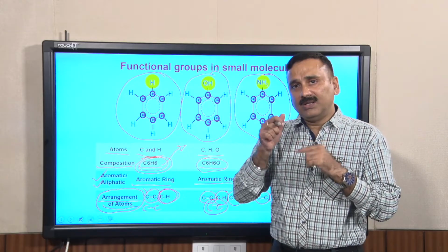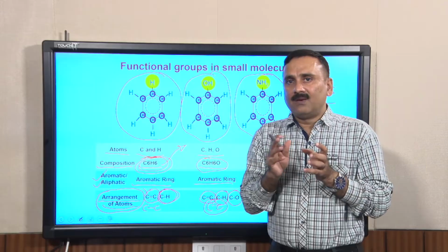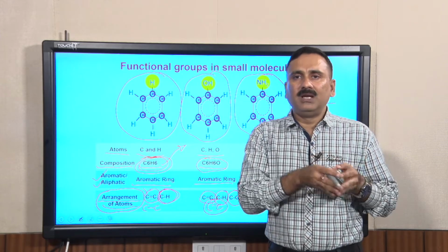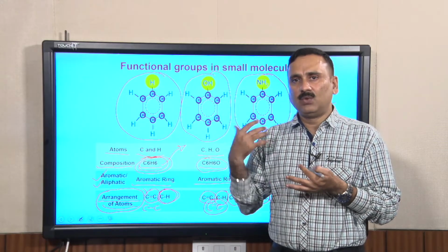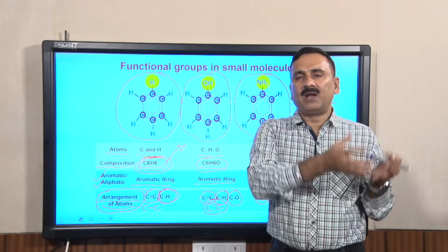And once you have all these three pieces of information, you can know what my predictable structure could be, because you are not doing this blindly. You are trying to isolate a particular type of molecule, and in this study we are just trying to confirm the product based on our prior information.